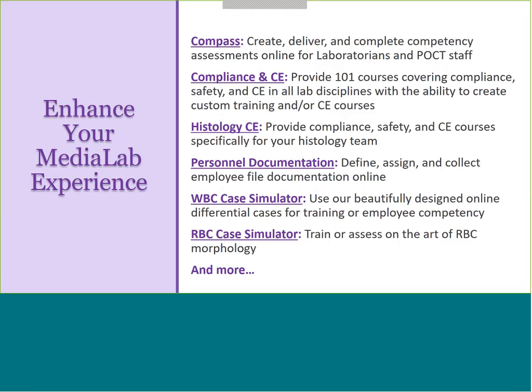I just wanted to mention quickly before we get into the demo portion that MediaLab does offer a number of other software modules. We have Compass that handles competency assessments electronically or online. So we do that both for laboratory staff, on your lab instruments, and we also do it for point of care. We have the compliance and CE system, and that system is our learning management module where you'll have 101 courses available for your lab staff. It covers safety and compliance and all of the lab discipline specific CE that we offer.